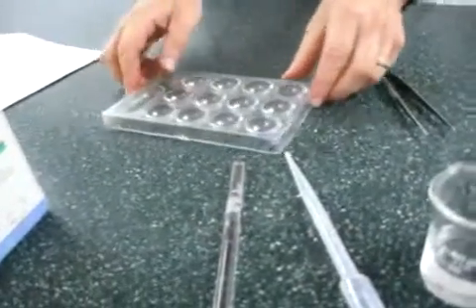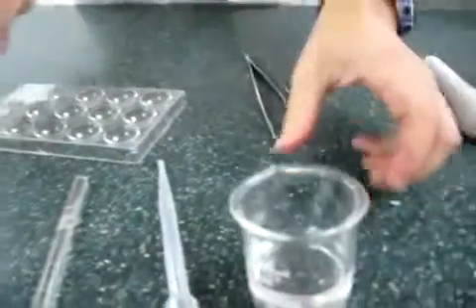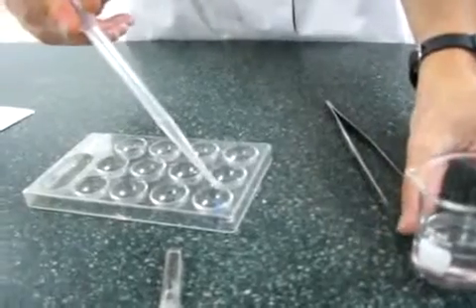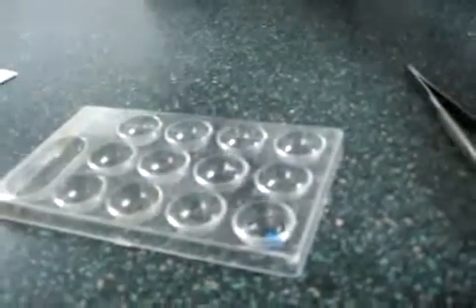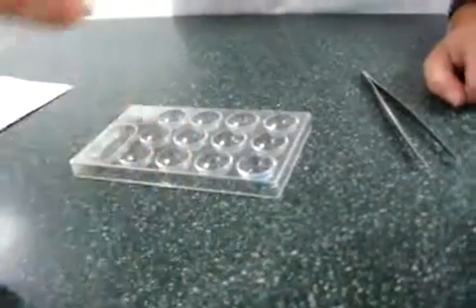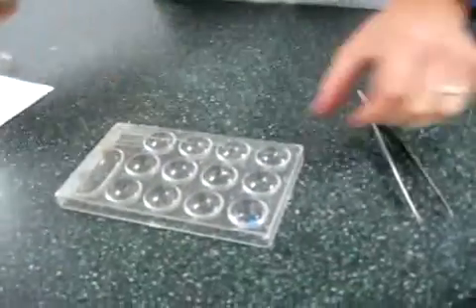The next test you will perform on chemical 1 is a test for solubility. You will collect a small sample of water using your pipette. Drop in 1, 2, 3, 4, 5, 6, 7, 8, 9, 10 drops of water. Let the crystal sit for 30 seconds and determine if the sample is soluble.